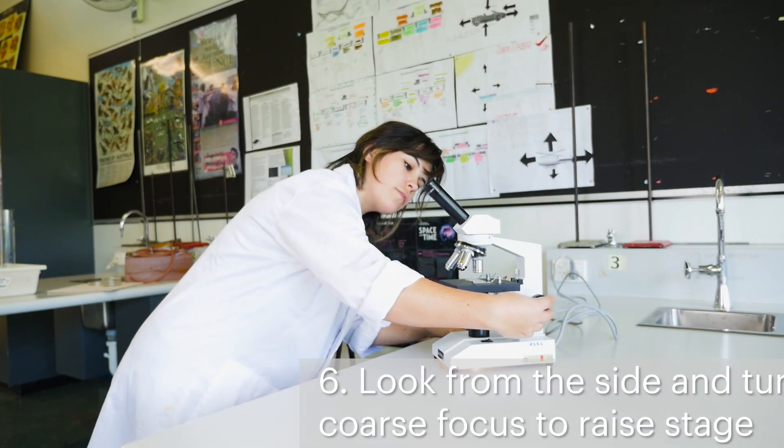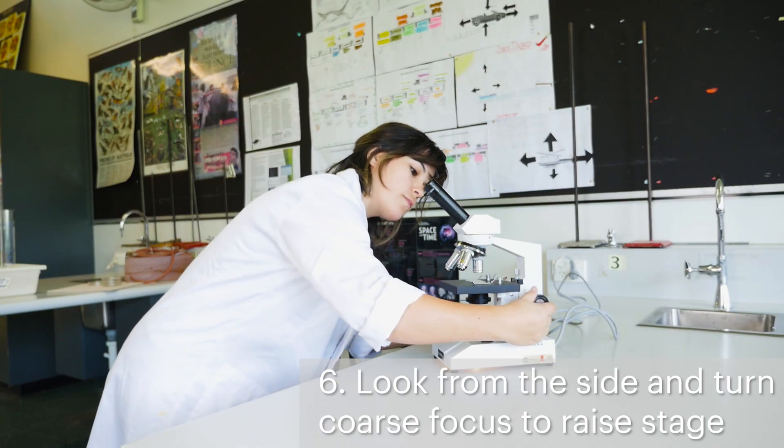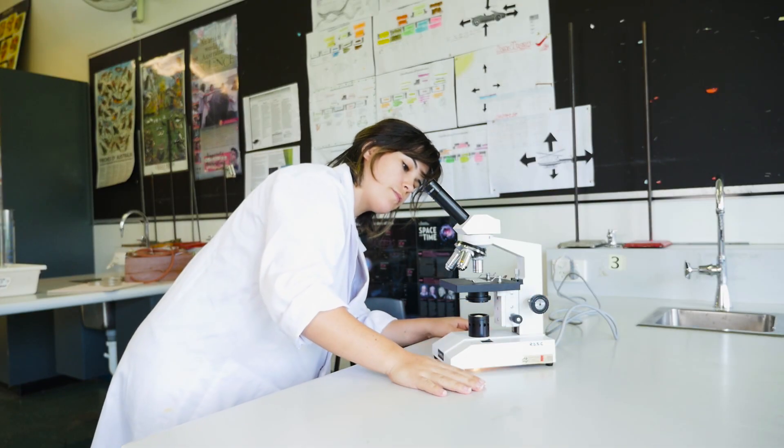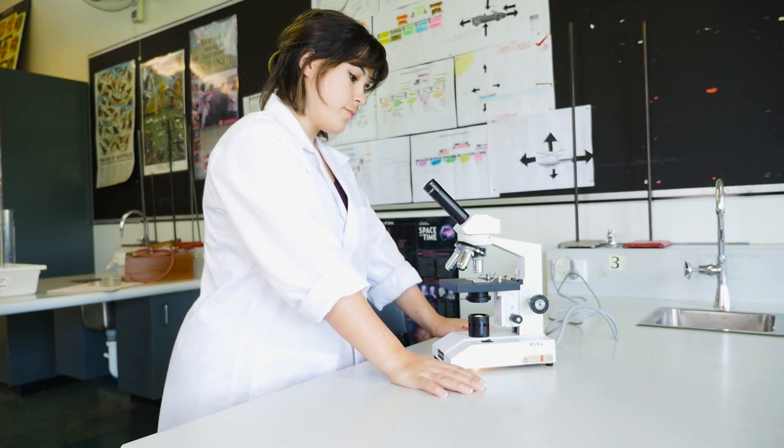Look from the side while you turn the larger coarse focus knob to move the stage up to its highest position, close to, but not touching, the objective lens. It's important to look from the side so you don't risk smashing the slide or the objective lens by going too far.